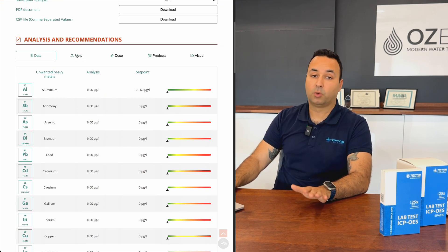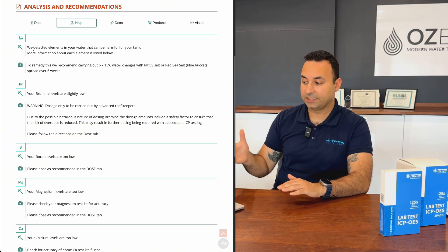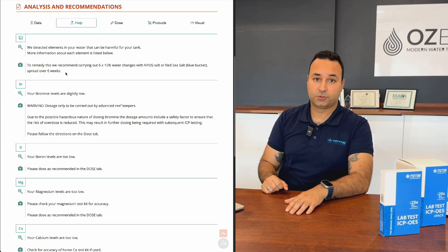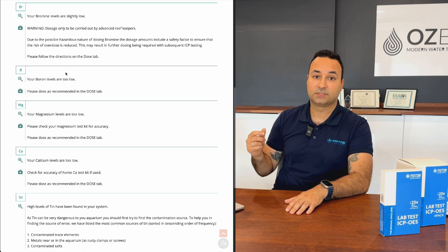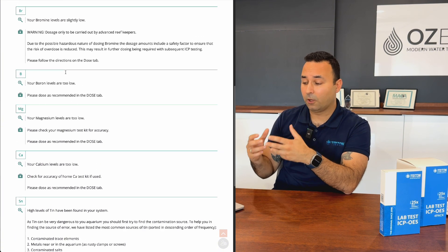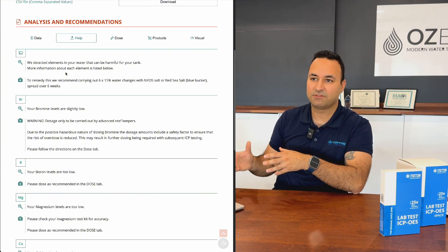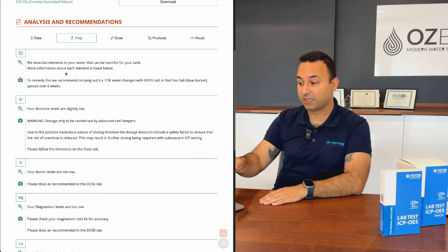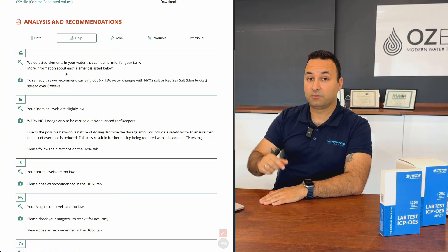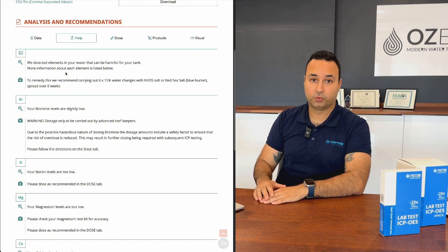In my opinion, the most important tab is the Help tab. It pulls together your habitat, your reported problems, and your test results to guide you through any issues it identifies as critical for your aquarium — prioritizing the most serious ones first, such as heavy metal contamination. ICP testing is primarily about error correction — roughly 70% of its value is helping you eliminate mistakes and improve your aquarium.